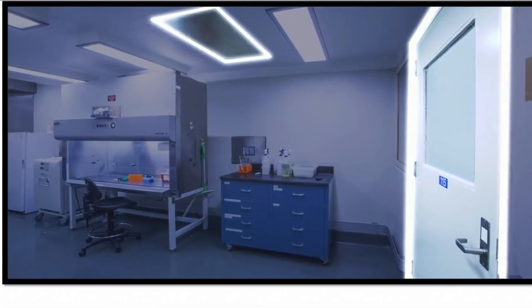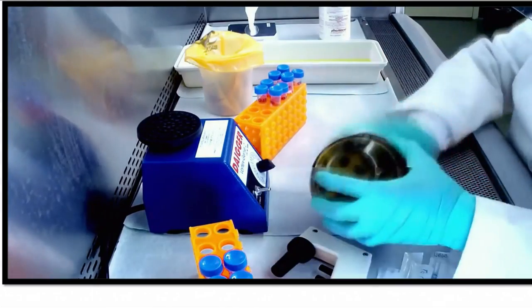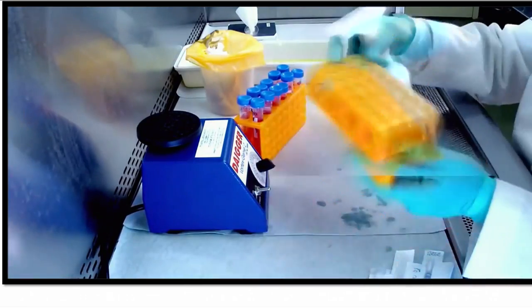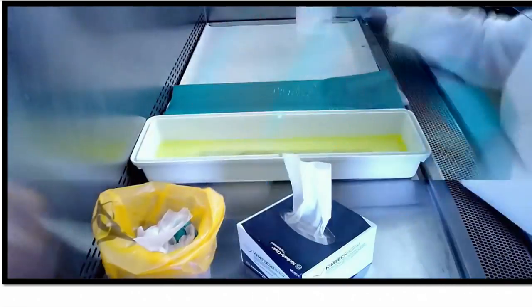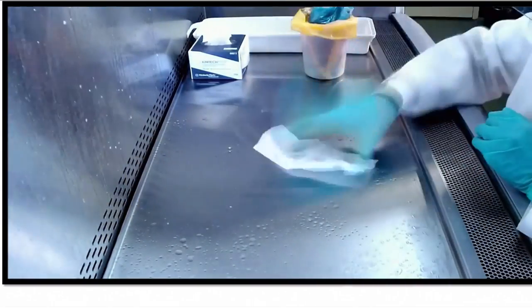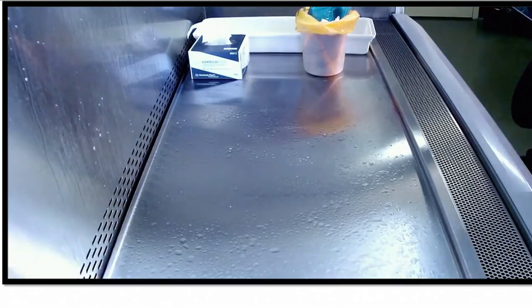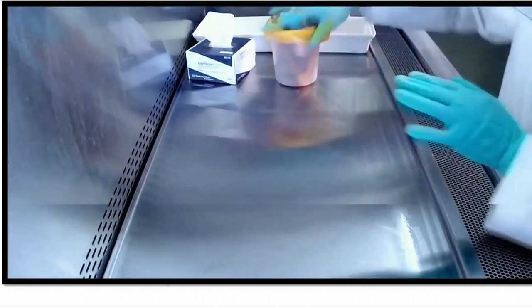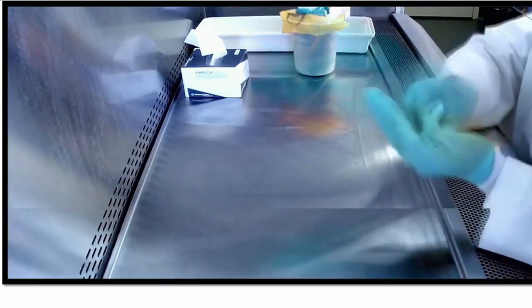When you have completed your work, any reusable items should be wiped down with disinfectant before removing them from the BSC. Next, the interior surfaces of the BSC should be decontaminated using the appropriate disinfectant for a contact time recommended for the agent used. To be sure, a second decontamination is advisable.